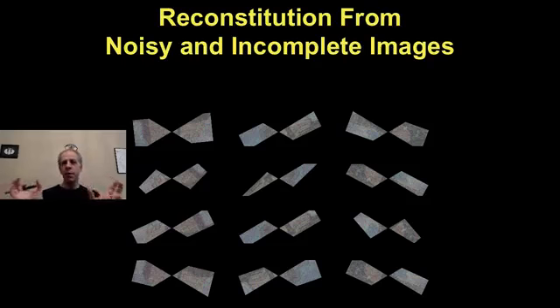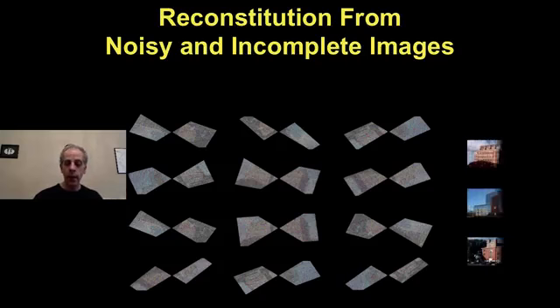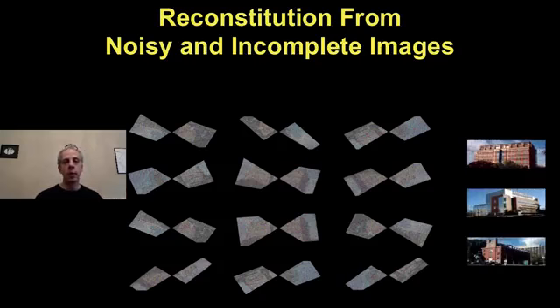If we have 30 degrees missing, we have 60 degrees missing out of 180. That's a lot of missing information, and that's represented here. So these holes are a realistic proportion. You have this, group, align, do everything, and hopefully after you're done, of course, doing all the rotations, all the groupings and everything together, you're able to reconstruct back the virus or the images as we represent here.